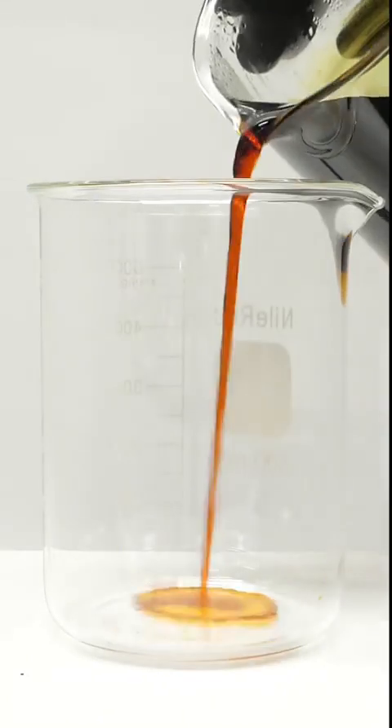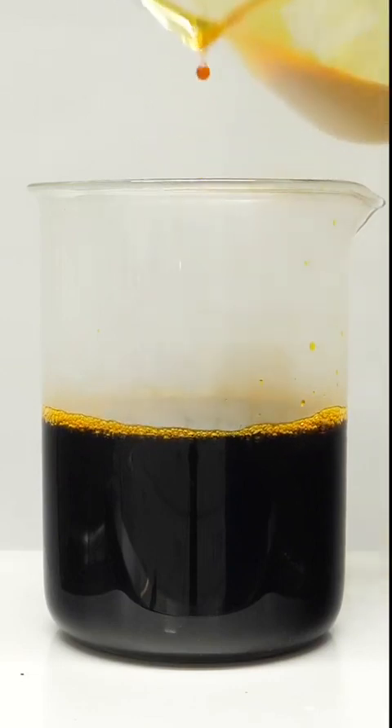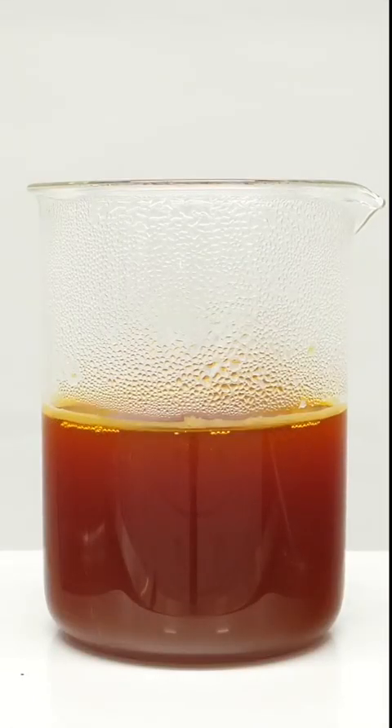To get rid of this sulfur, I'll get another beaker and I'll pour out just the dark liquid. I'll also add a stir bar, and what I have to do next is wait for it to cool down. This ended up taking about 40 minutes, and now it's finally time to make the bouncy ball.